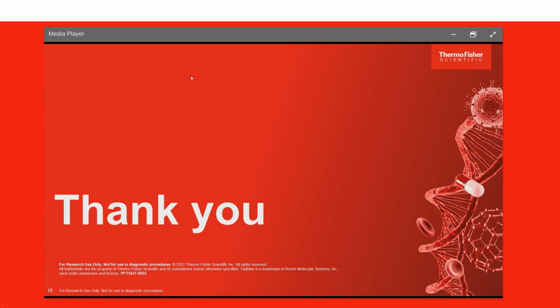what material you want, what dye you would like bound to the 5' end of your probe, and specialty oligos can accommodate your request. And so I believe the email address for specialty oligos is actually in the slides in today's presentation. But yes, other dyes other than FAM and VIC can be ordered for these TaqMan assays.